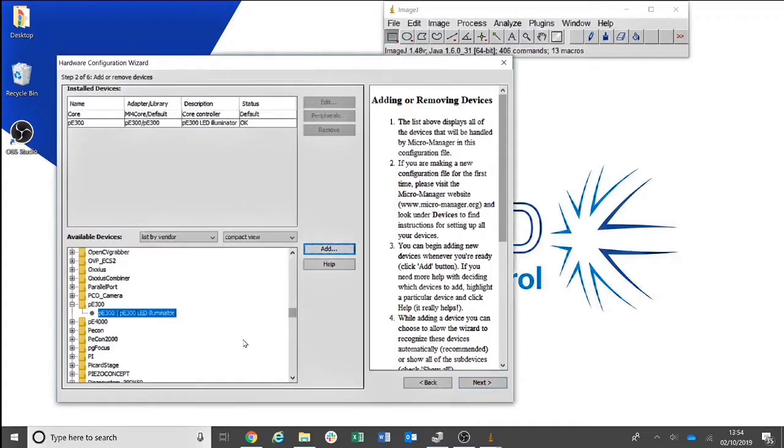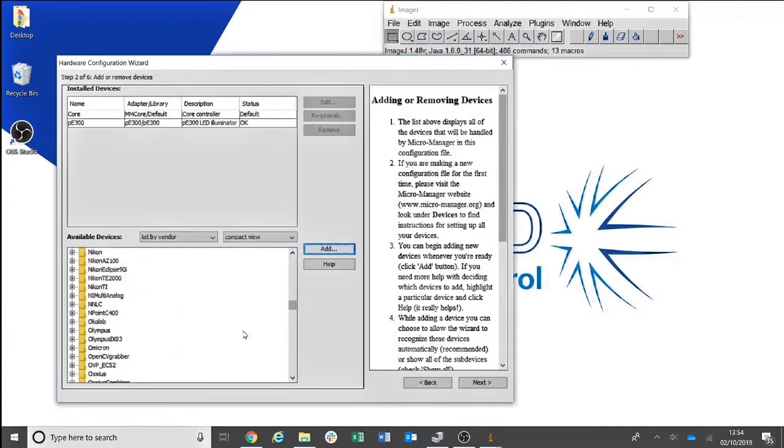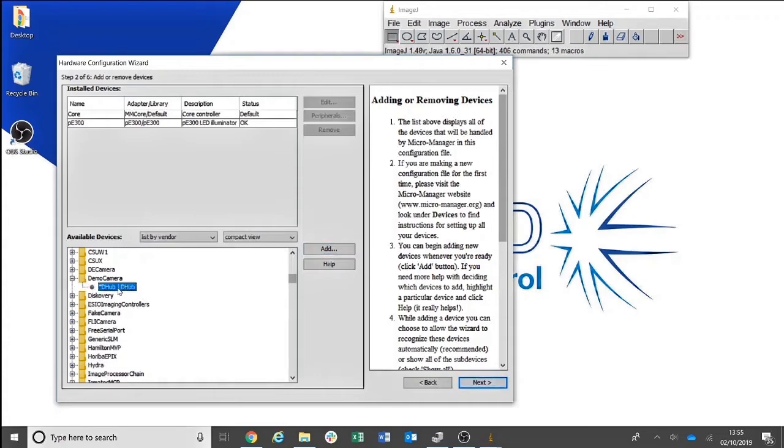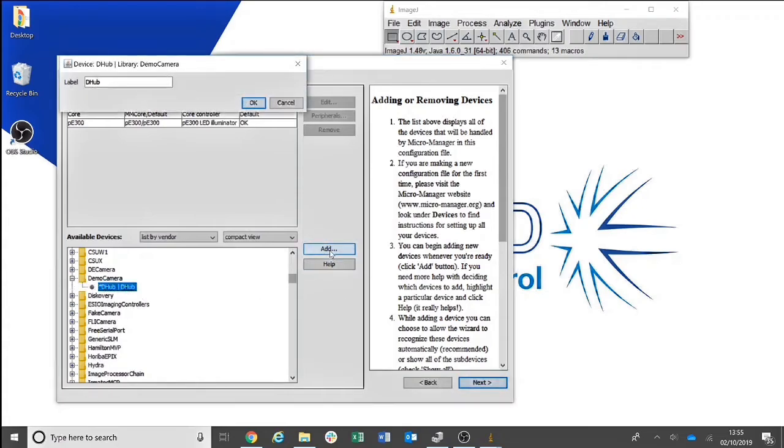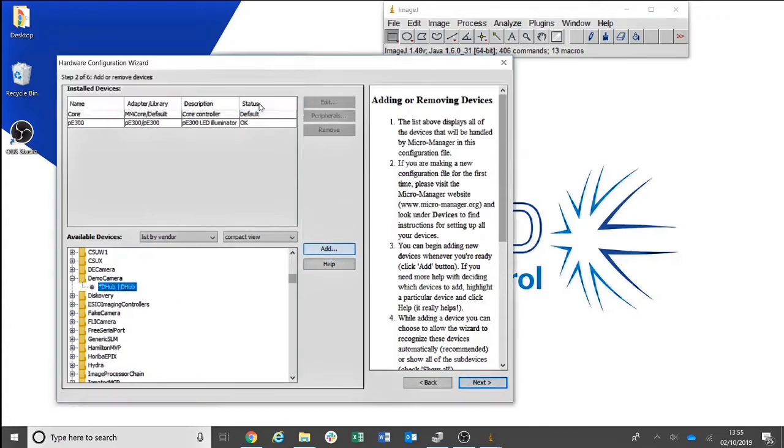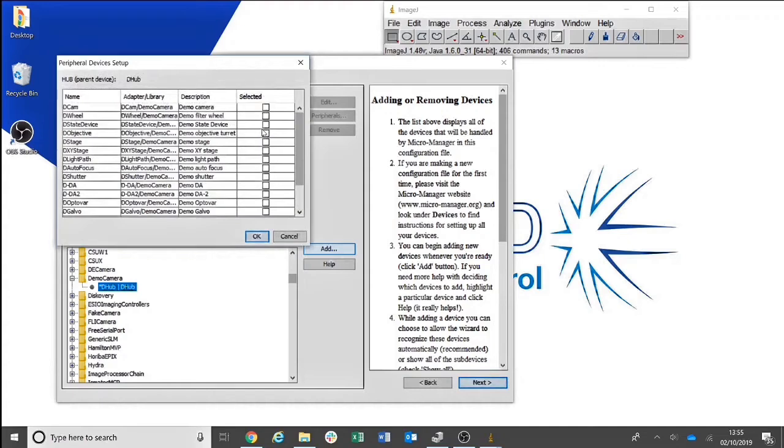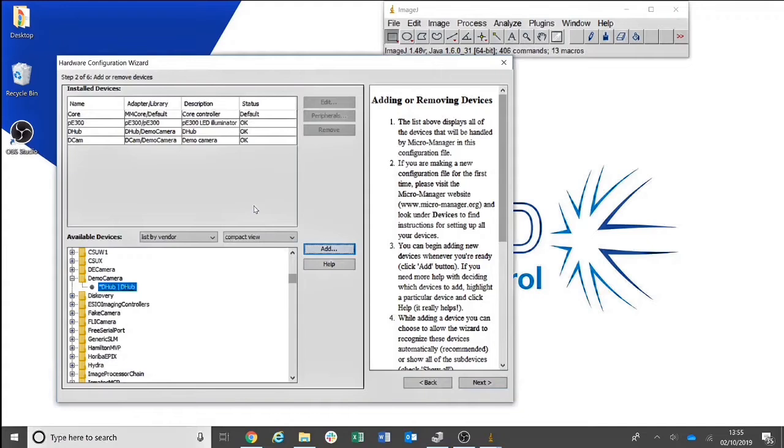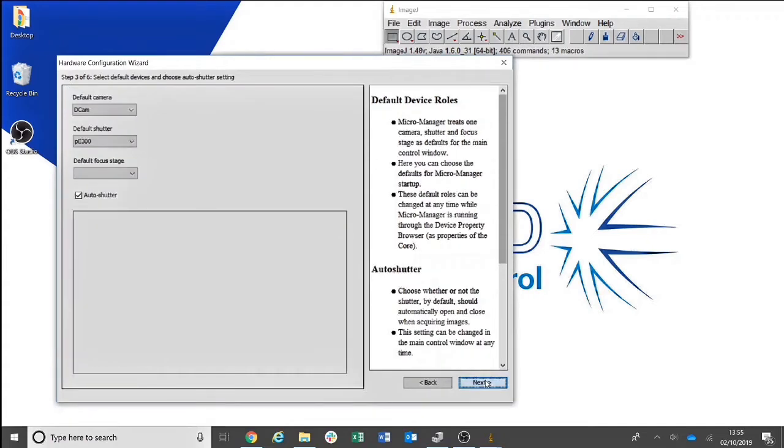You will then be able to add any other available devices that you have connected to your setup. In this case, we will be adding a demo camera as we do not have a camera connected. You can then head to Step 3.